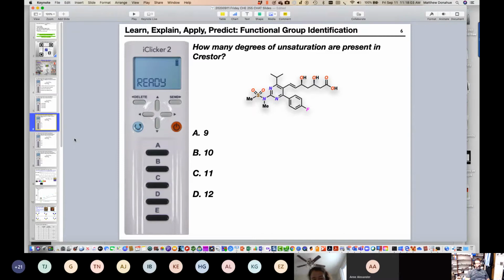And again, we're building on these concepts because the rings, the pi bonds, that's how we differentiate how things are hybridized. And we'll see when we start looking at NMR data that carbon atoms and hydrogen atoms occur in different regions in those types of spectra.